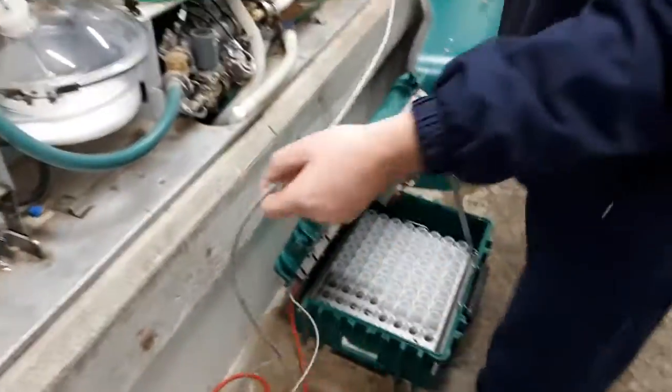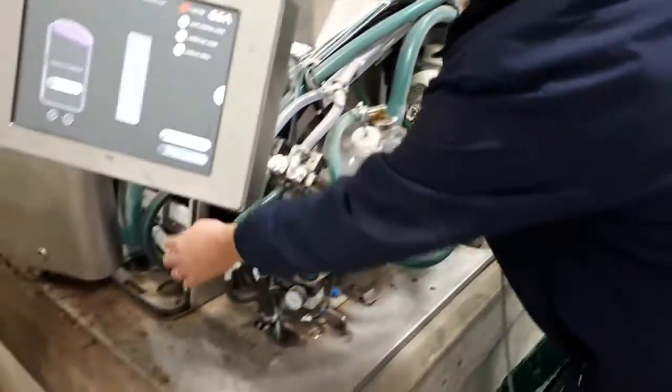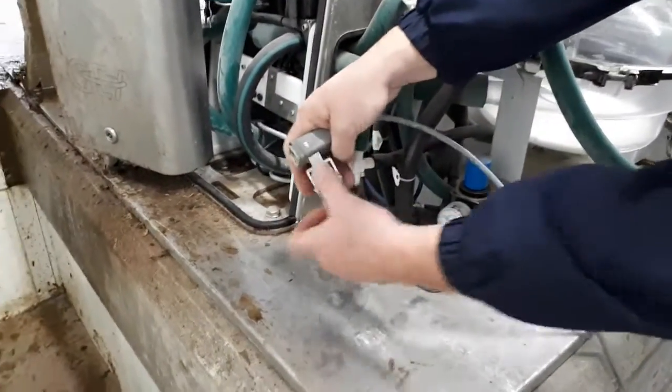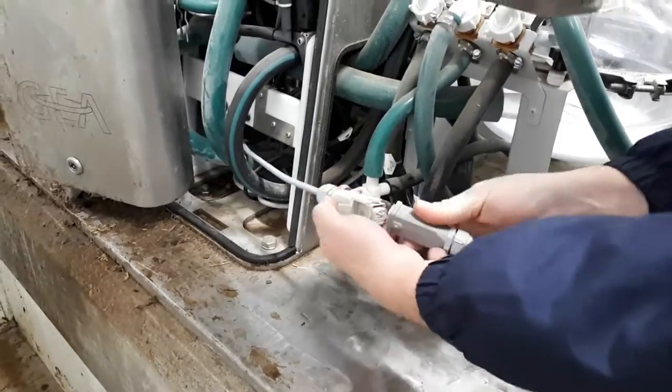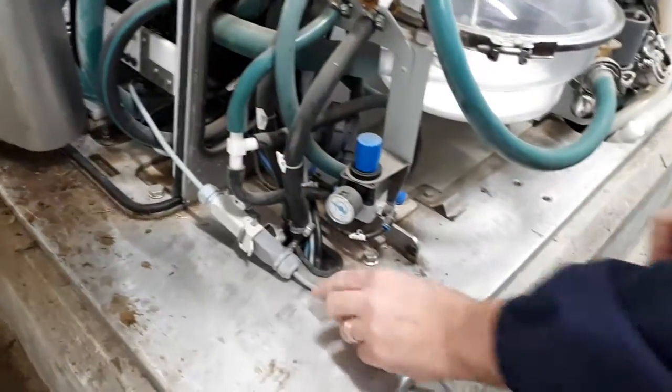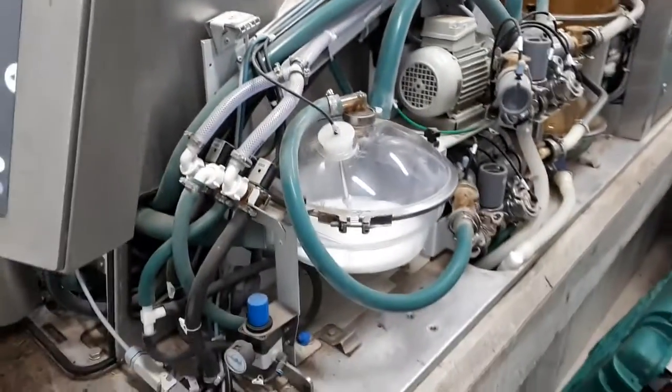So we have our electrical cord on this particular unit today. The plug-in is right down here. All we're going to do is remove the end — it only goes on one way — and snap it on. Sometimes this electrical cord could be sitting up here as well, so you may have to look and see where it is.